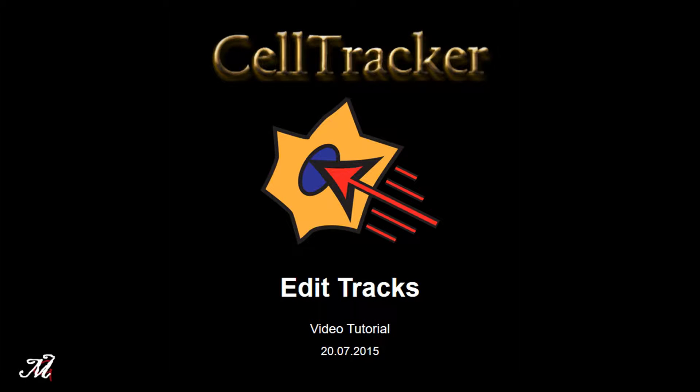Welcome. In this video tutorial, I will show you the functions we implemented in CellTracker to edit the tracks.